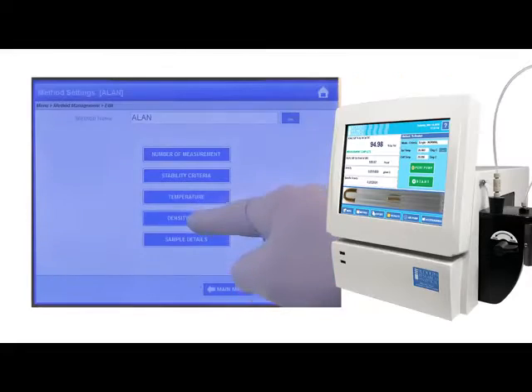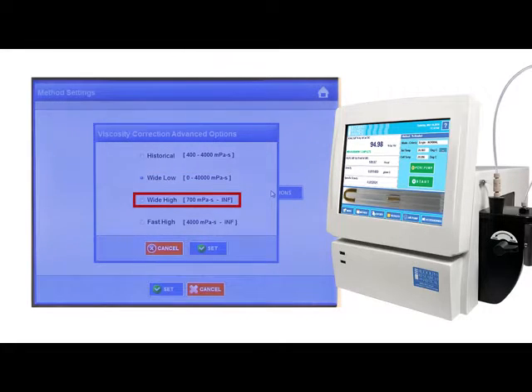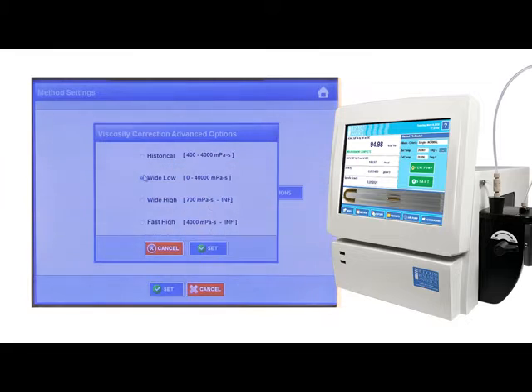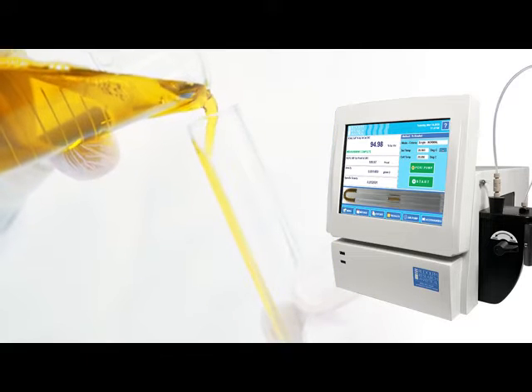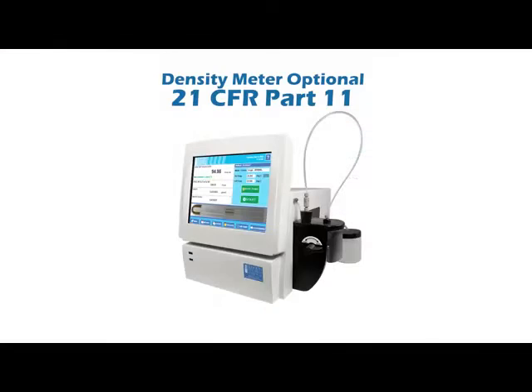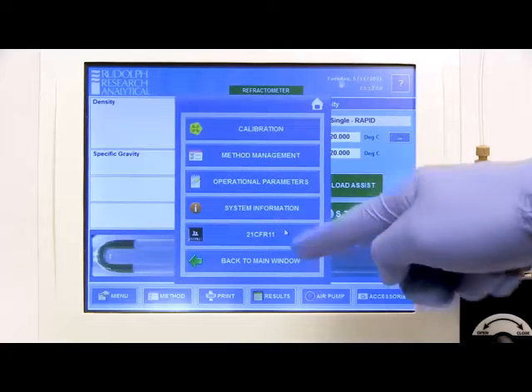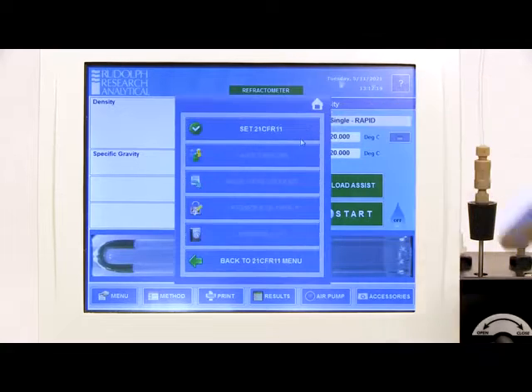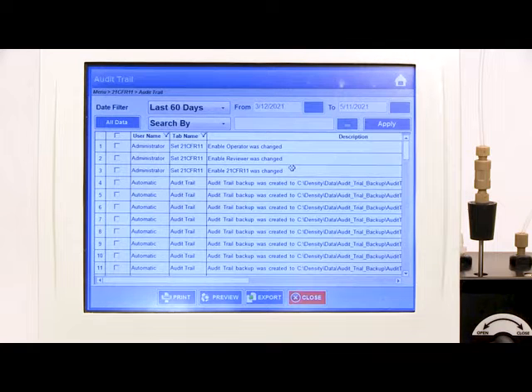The viscosity correction algorithms are the most comprehensive in the industry. The full range of solution viscosities can be measured and the data corrected for any degree of viscosity. The Rudolph density meter series optional 21 CFR Part 11 module is easily enabled through the user-friendly touch screen and affords you full compliance to current 21 CFR Part 11 standards.